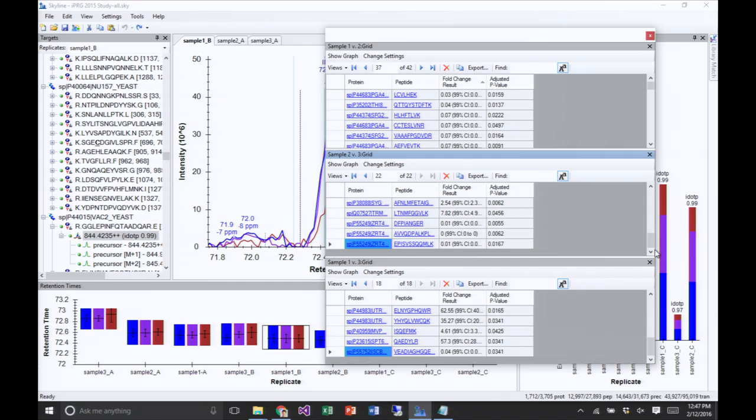And so you cannot report the adjusted p-values after you've already narrowed things down, because that's not the experiment you did, right? If you had gone in and said, I want to test to see whether these 5 proteins are changing, and that had been the experiment you set up to test, you could report those p-values.